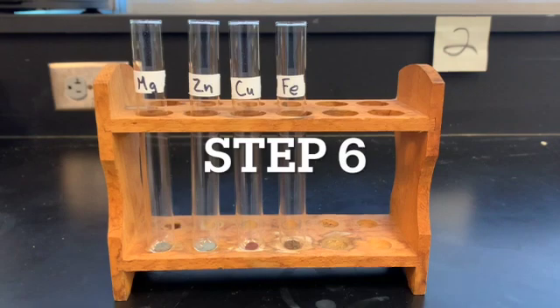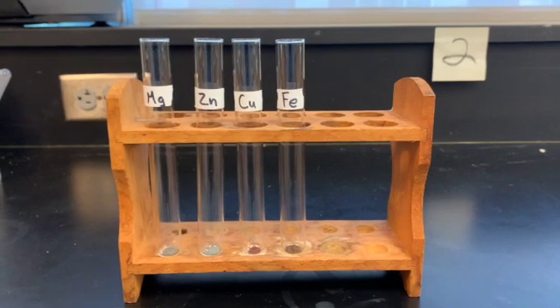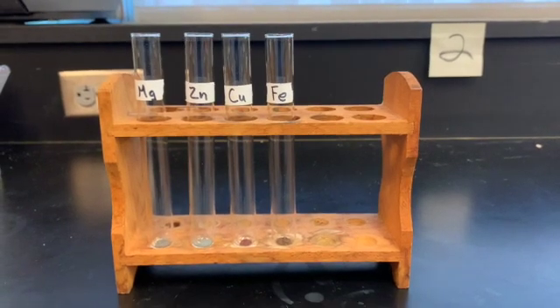So the next step, we're actually going to add one mL of six molar HCl to each test tube and observe the reactions. It is very important to note the relative times in your observations, since this will help you establish the activity series.